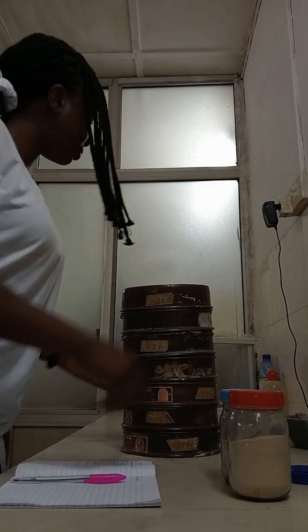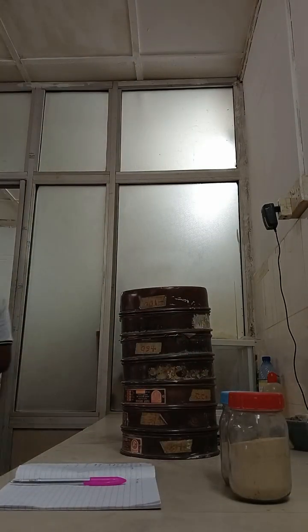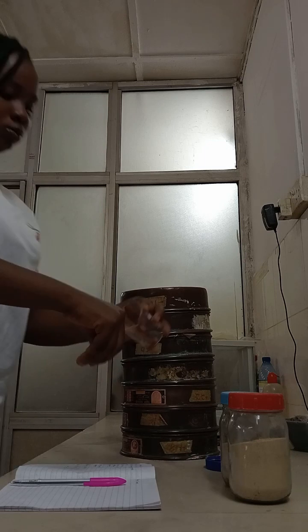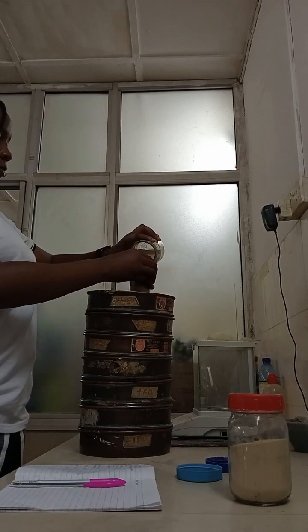Hello, come with me to the laboratory of this particular company where I'm currently doing my internship. As an industrial chemistry student, you have to pass through an internship, which is called the IT. I'm currently doing my IT in a company that produces glass, and this is me trying to perform a sieve analysis for a particular sample that is used to produce glass.